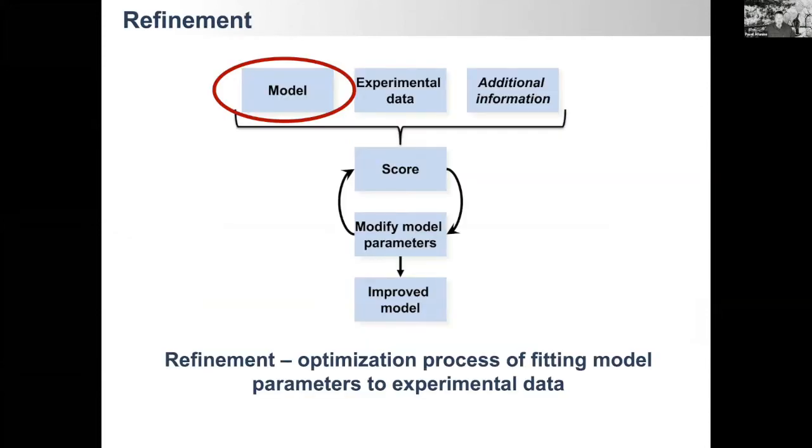Okay, so my plan for today is to go through these steps of the refinement procedure and talk a little bit about each of them. And then in the remaining time, which I hope will be about half an hour, maybe 25 minutes or so, depending, we'll run tutorials and actually practice doing refinement.